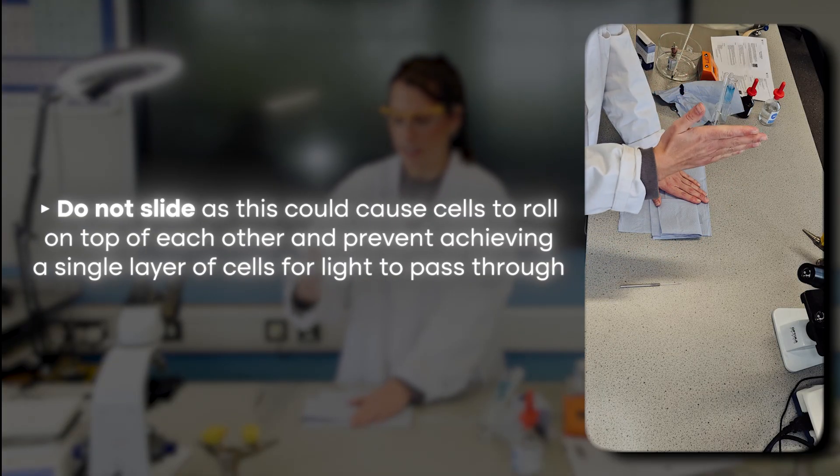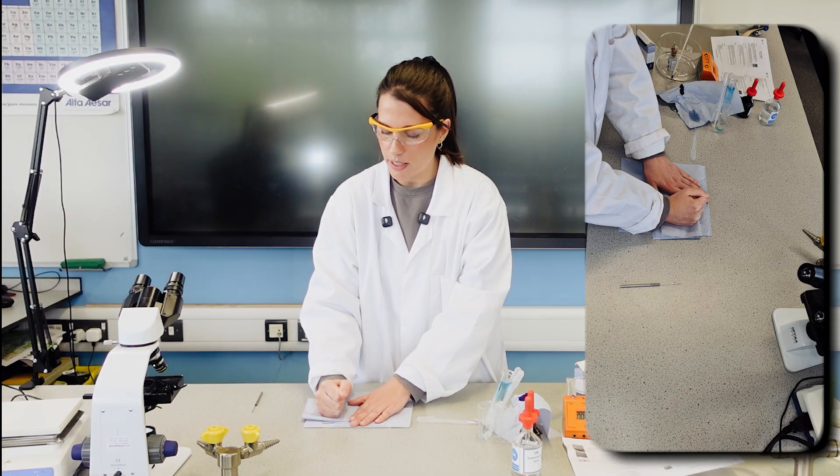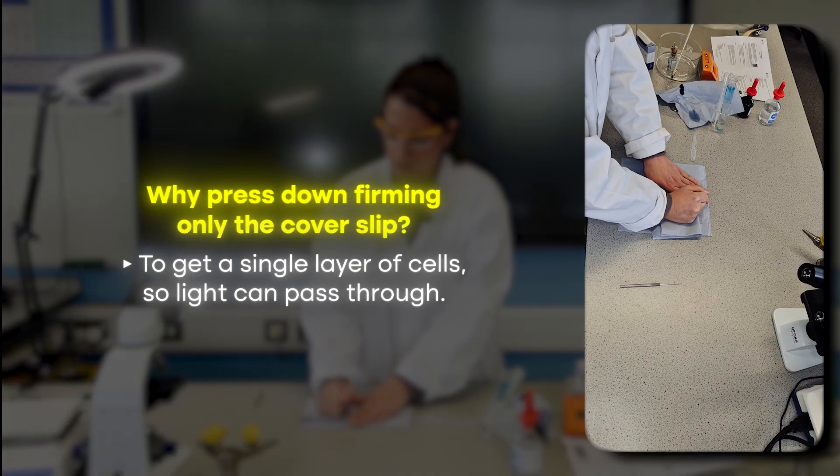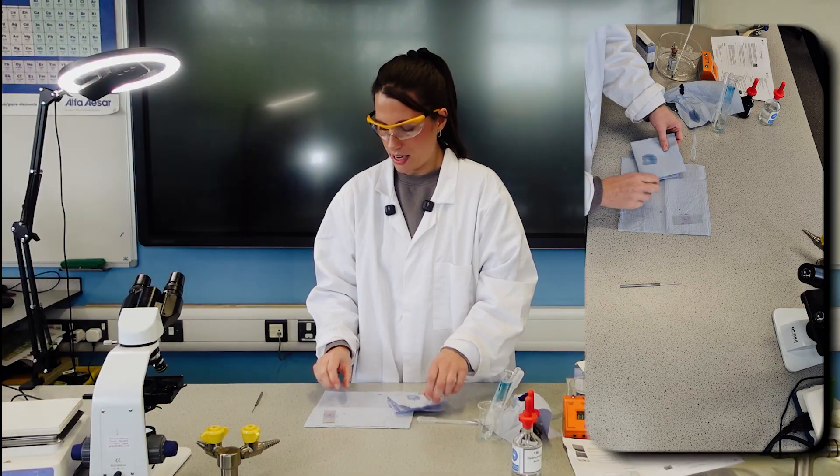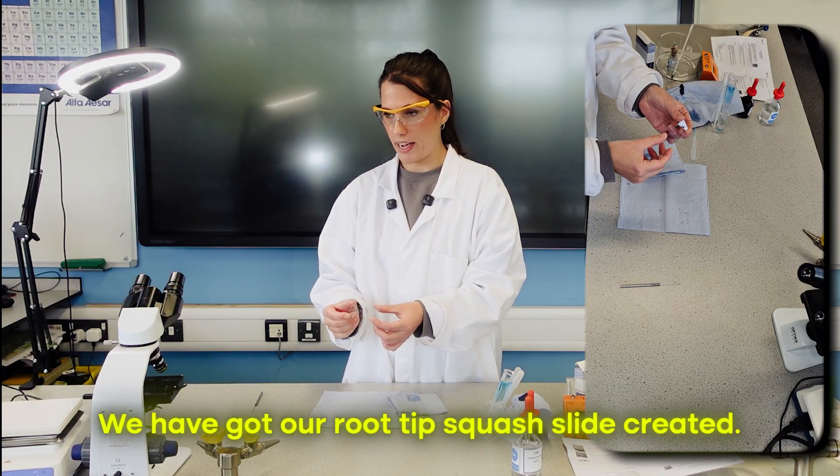It's also going to absorb any liquid either side. Just smooth my hand, not sliding it because we don't want to slide it. I'm keeping it in one position but just going back and forth, so it's going to gently squash it. And now we can see we have our root tip squash slide created.